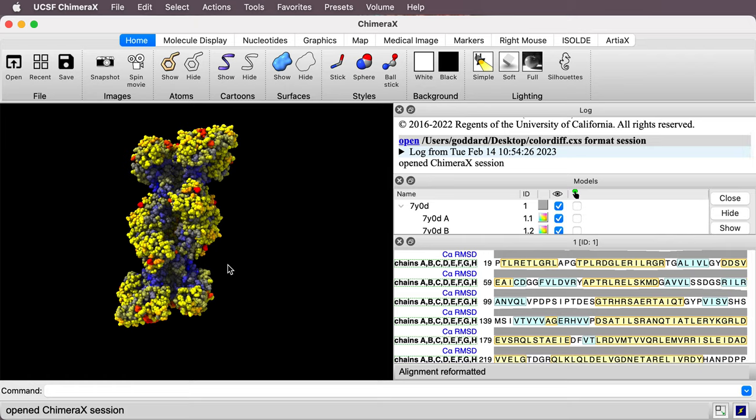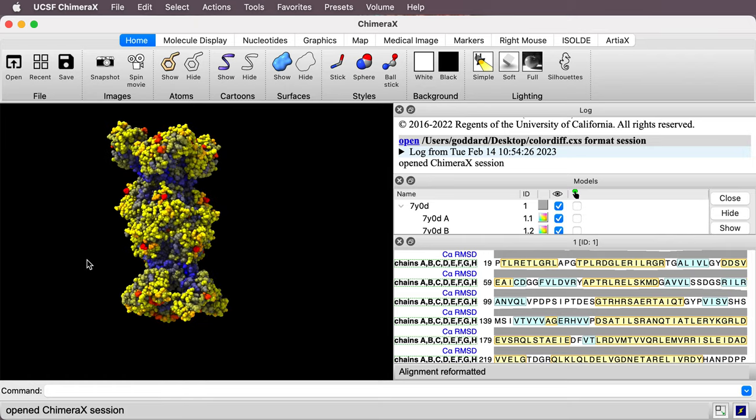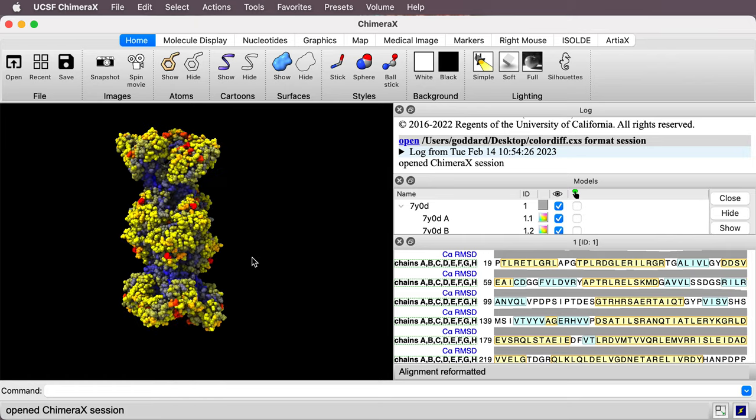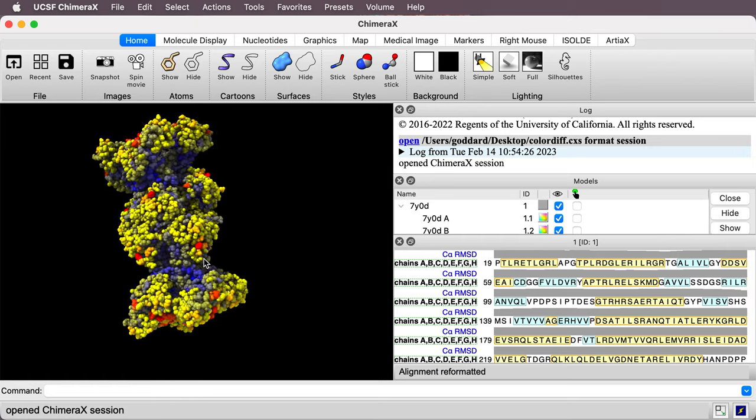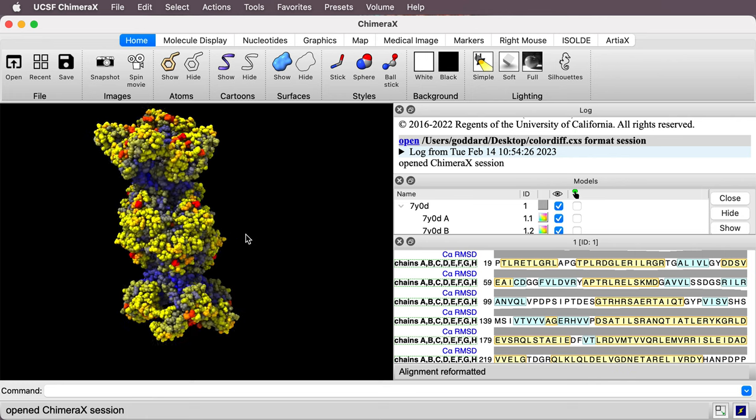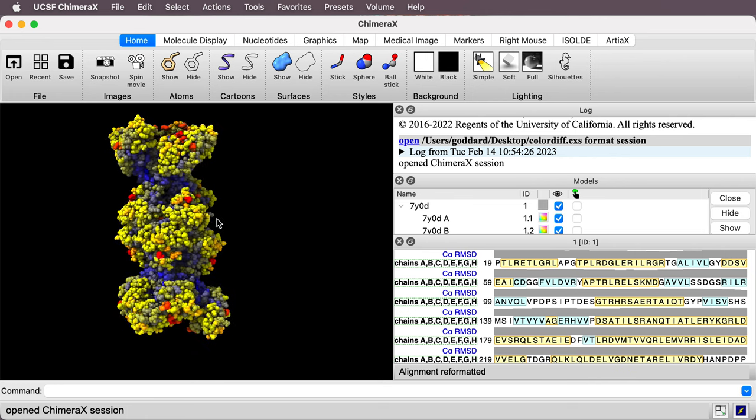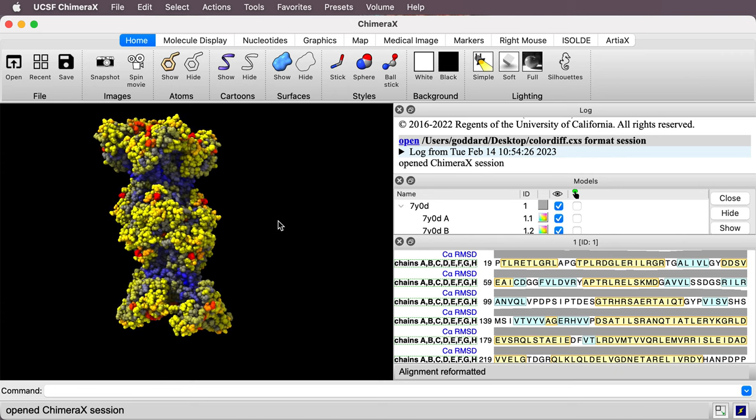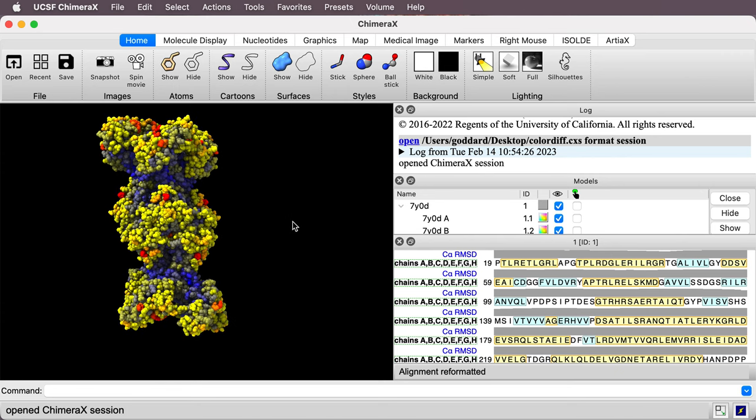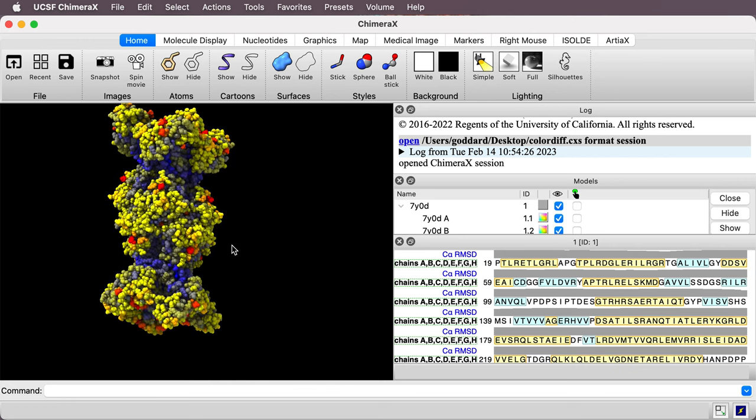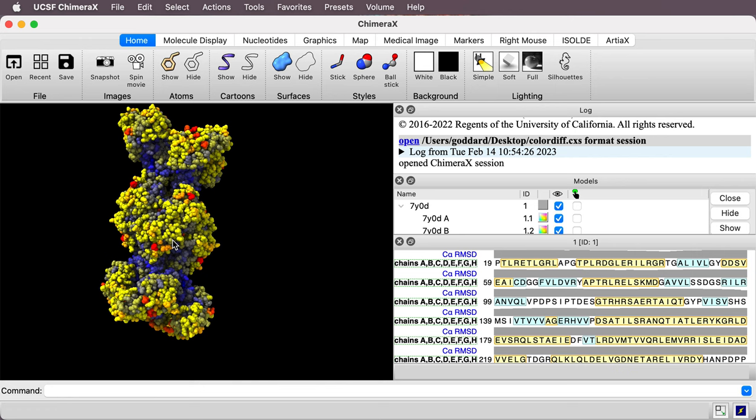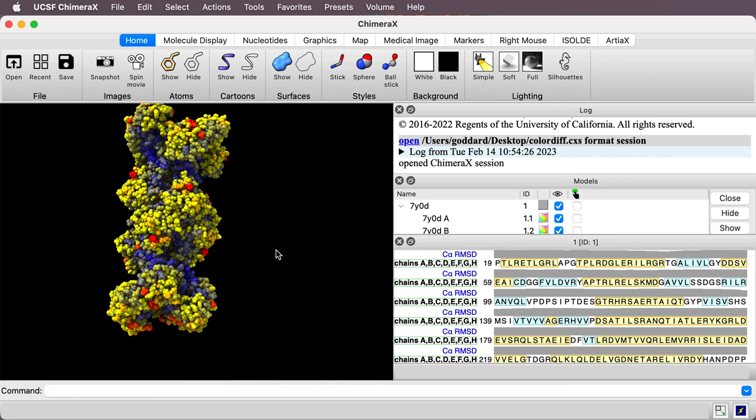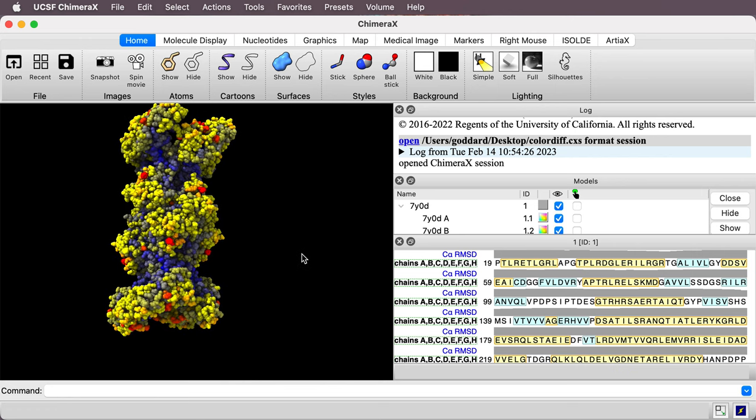I'm going to do this in ChimeraX and here I have eight copies of a DNA integrity scanning protein in a helical arrangement. The yellow regions are regions where the eight copies have different, somewhat different conformations, and the blue areas in the core are regions where the eight copies have very similar conformation.